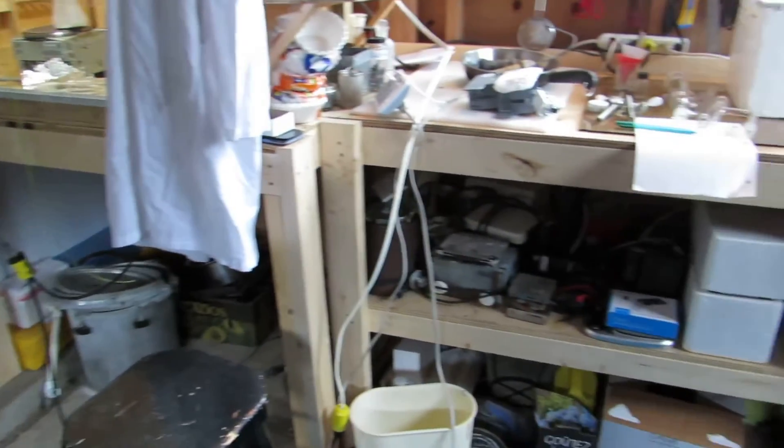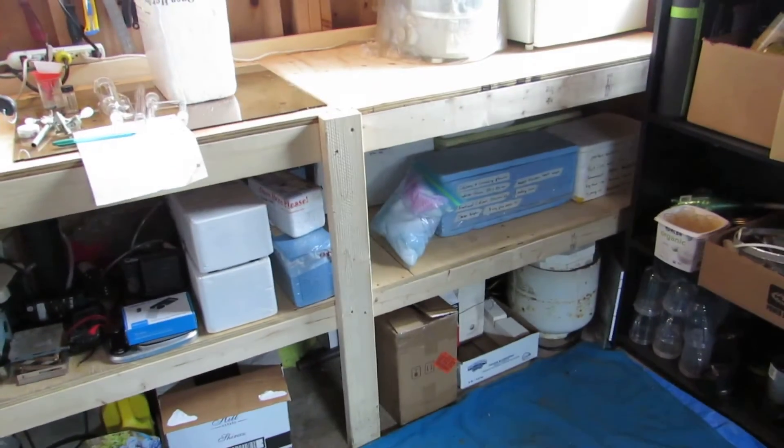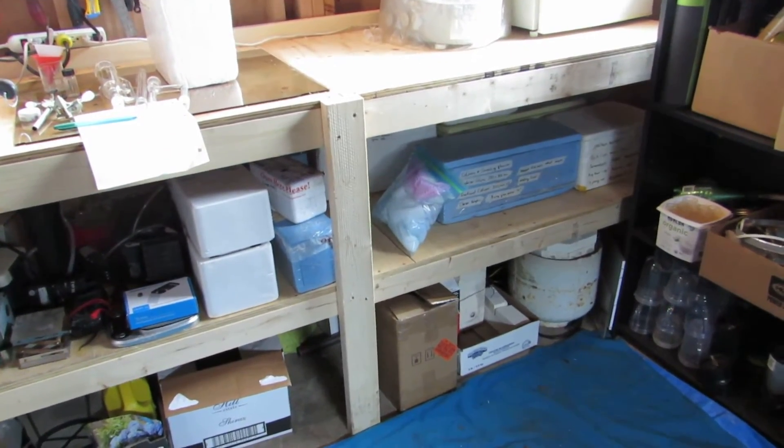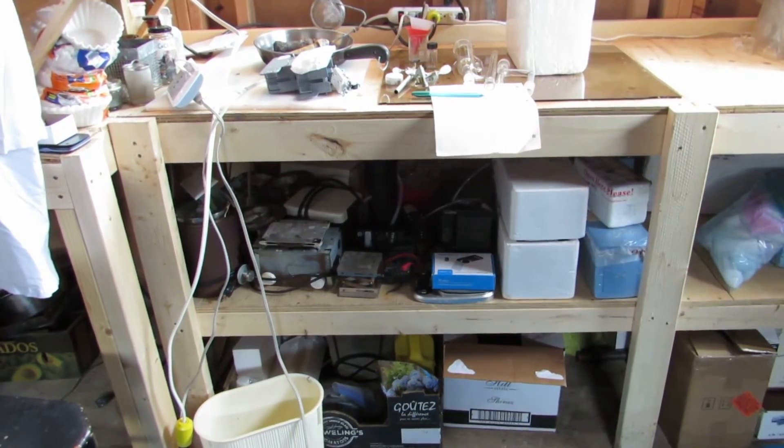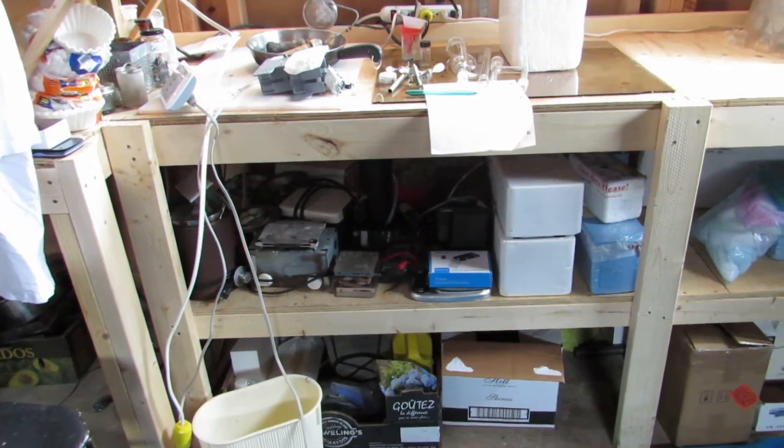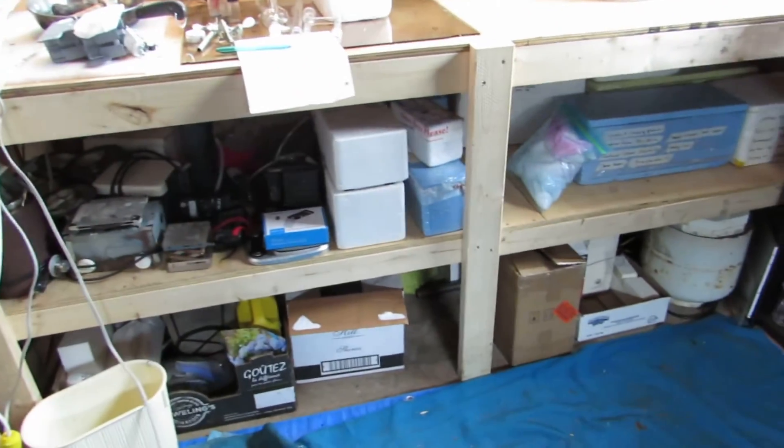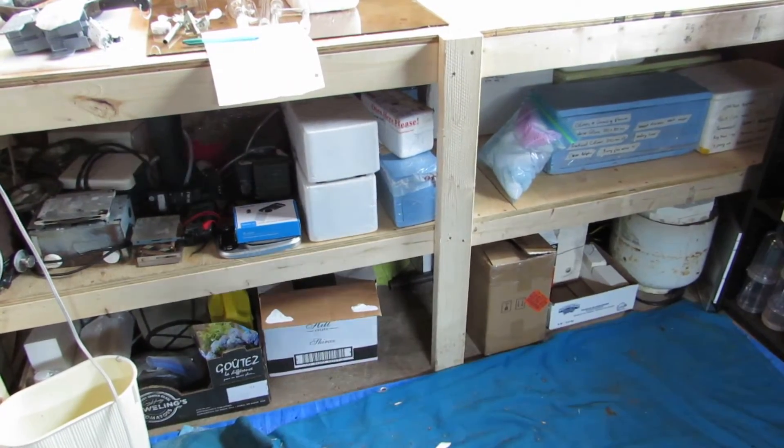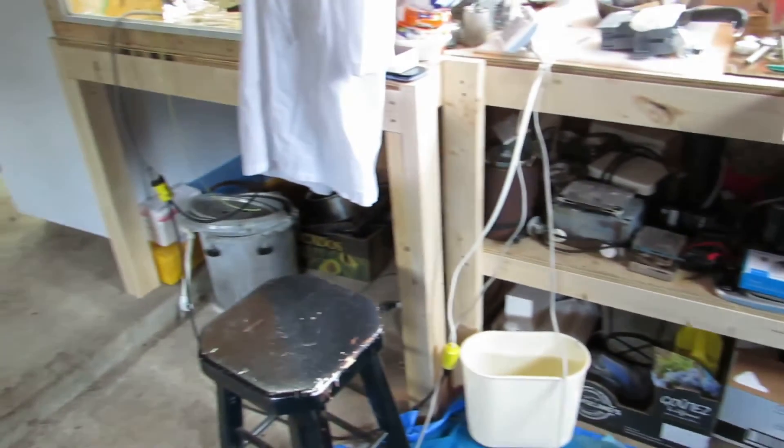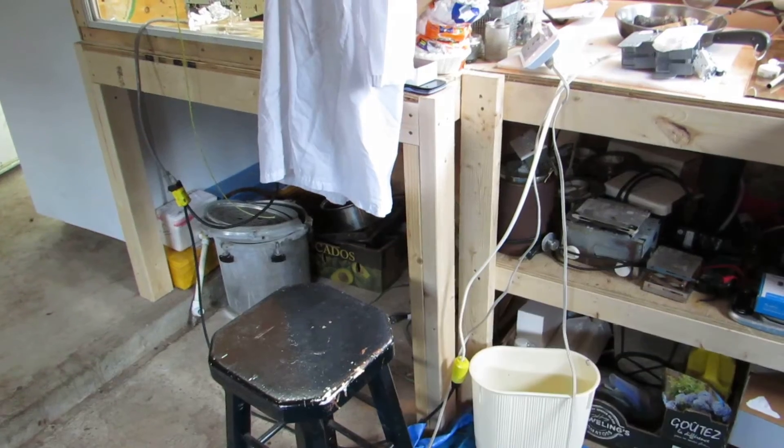Okay, so I have a work bench here and underneath I have a whole bunch of different chemicals. I have all my glassware right here, a whole bunch of my equipment like hot plate stirrers and heating mantles over there. Some miscellaneous stuff underneath which I plan on doing some experiments with. And I have all my pots and pans over there which is all pretty useful.